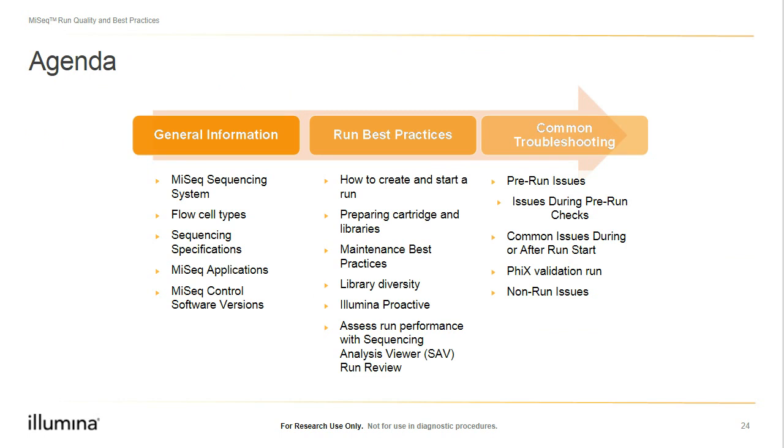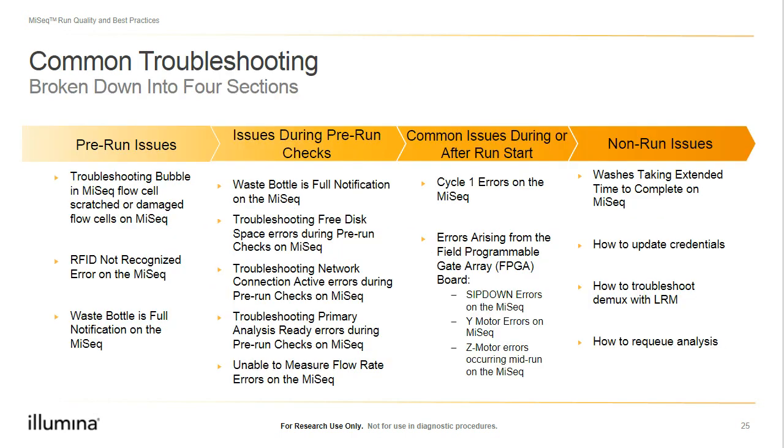Now that we've discussed some general information about the instrument, as well as some run best practices, let's get into some common troubleshooting. We wanted to break down the common troubleshooting into four sections, which is pre-run issues, issues during pre-run checks, common issues during or after run start, and then a few non-run related issues.